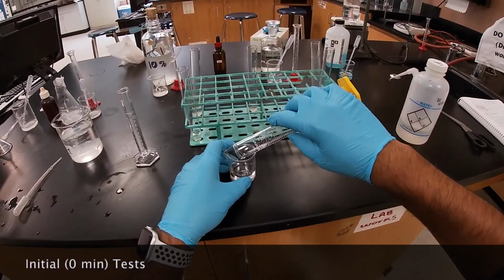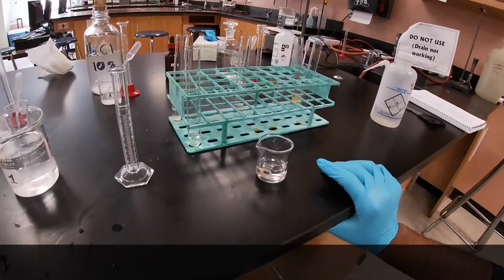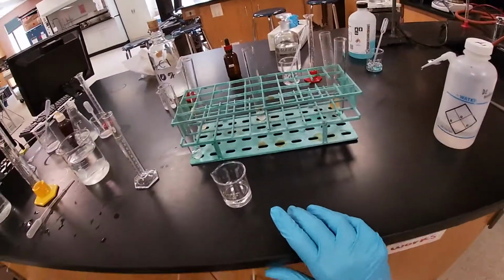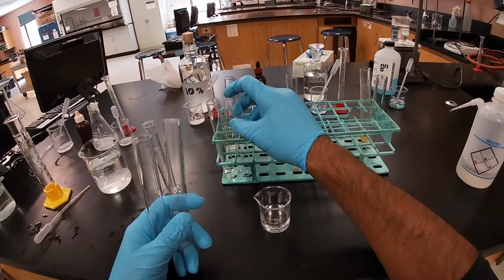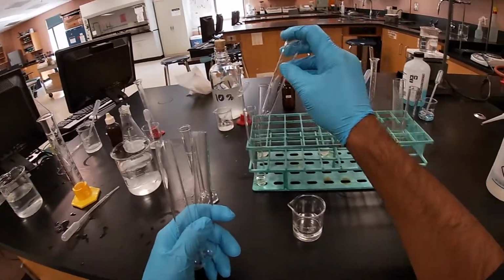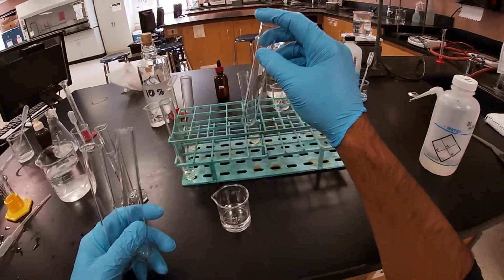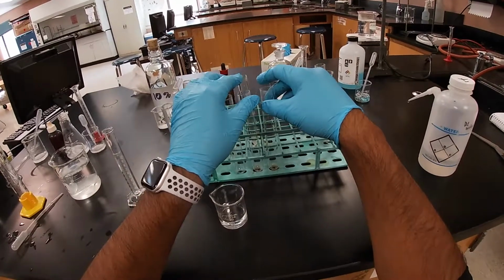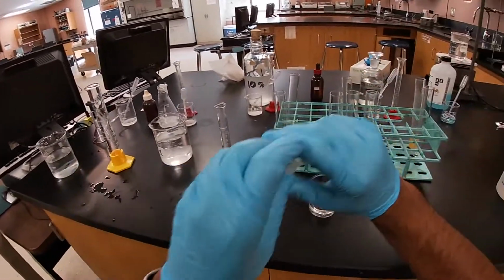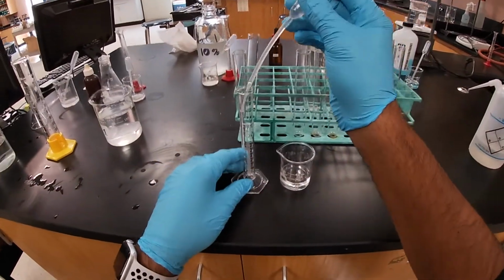And then what we're gonna do is distribute this solution, 5 milliliters, into test tubes. And so I'm gonna get 3 other test tubes. And as I get 3 test tubes, we're gonna do the 3 different tests. We're gonna test for our starch, we're gonna test for the silver nitrate, and we're gonna test for the glucose. Okay, so I'll go ahead and do it evenly. We'll measure out the first one and then kind of eyeball the next one. So let's measure the first one out. We got a graduated cylinder. We want 5 milliliters.